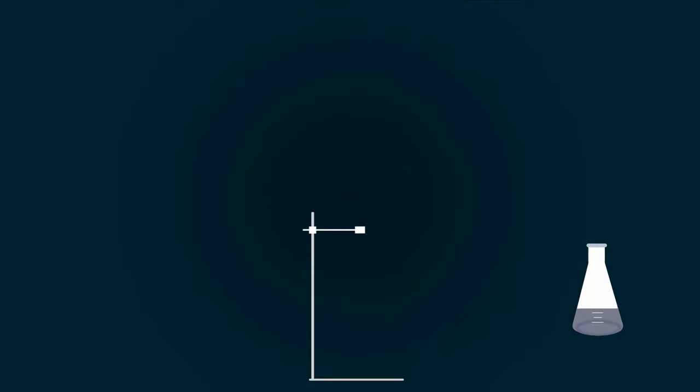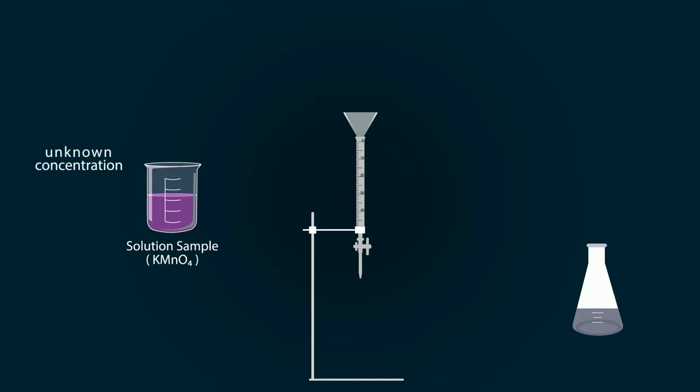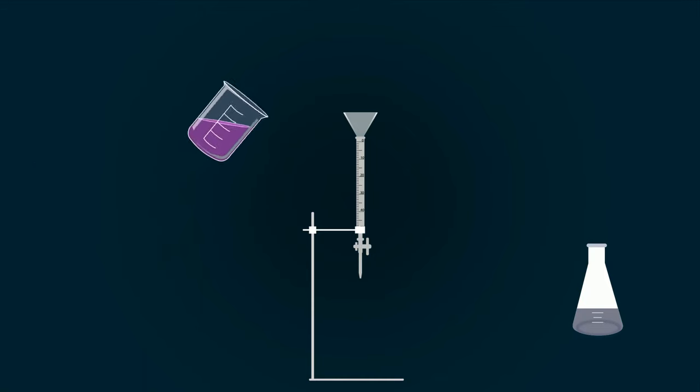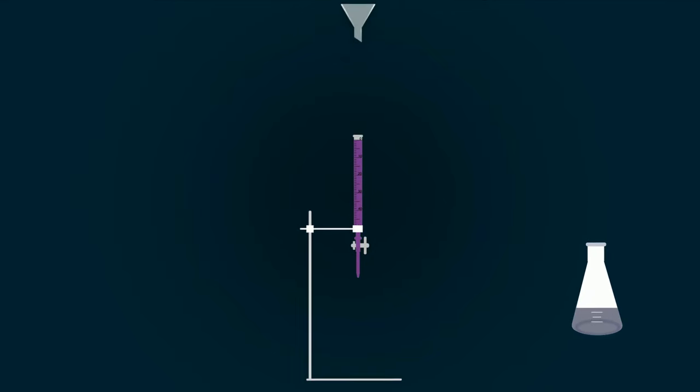Now take an iron stand and adjust the burette into it. Put the funnel on the top of the burette. Pour all the KMnO4 solution into the burette up to the zero point using the funnel.